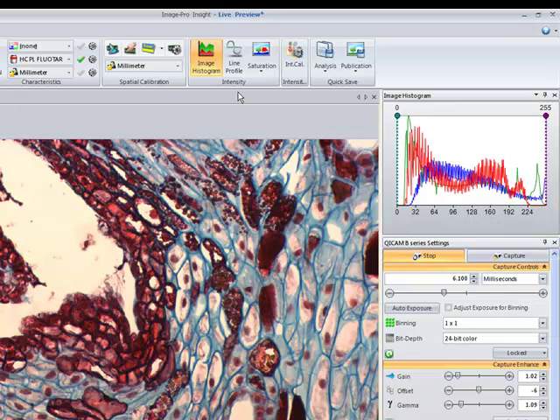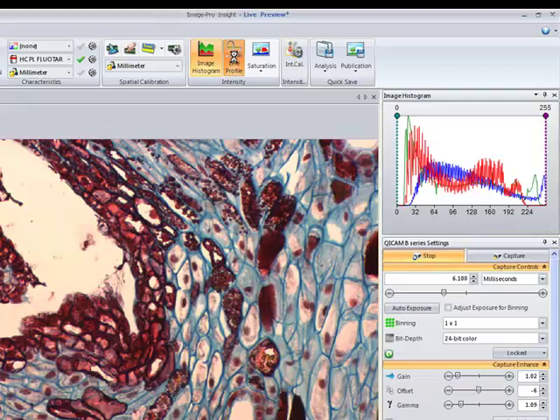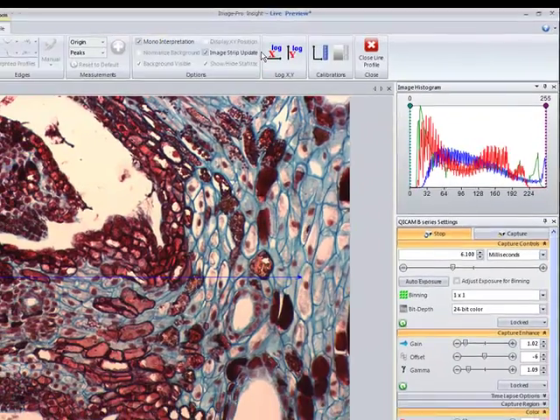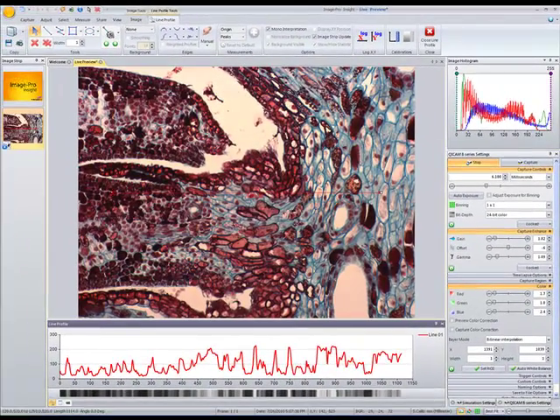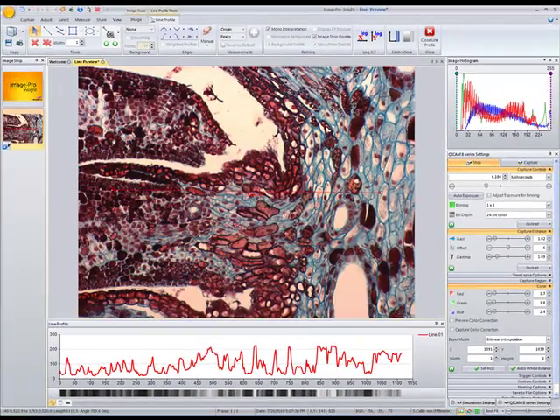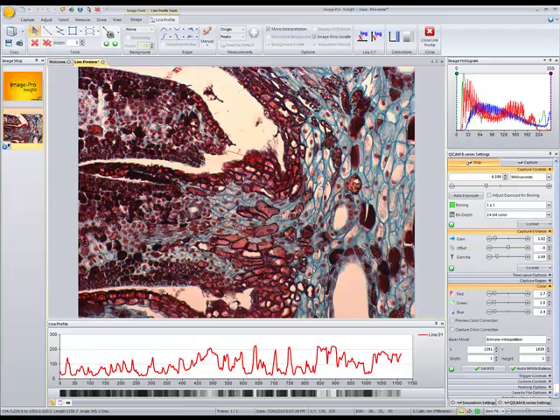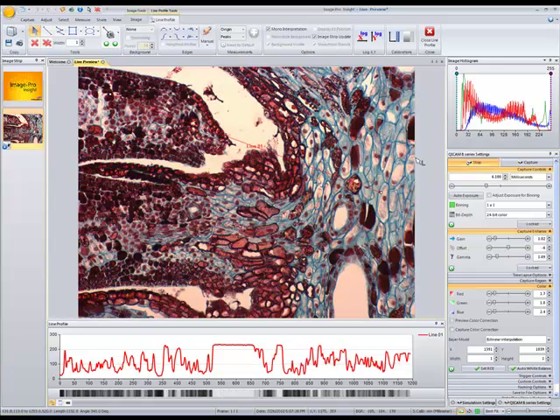ImagePro Insight also includes a live line profile tool, so we'll click on the line profile button and we can see a line profile is automatically displayed on our image.